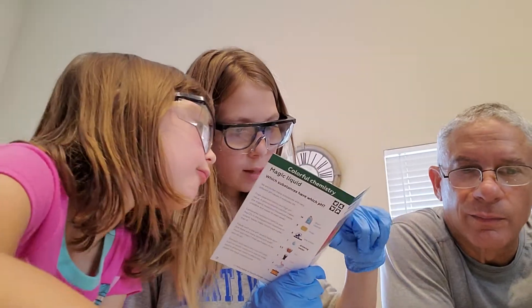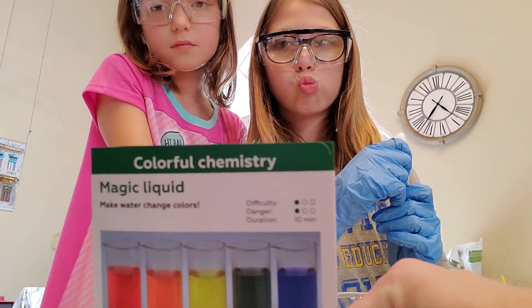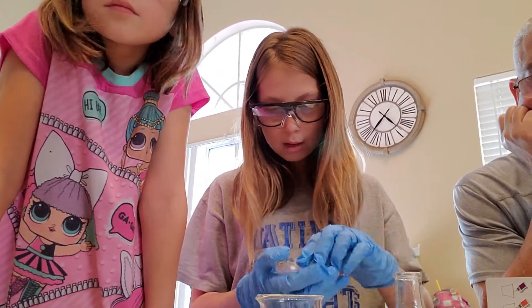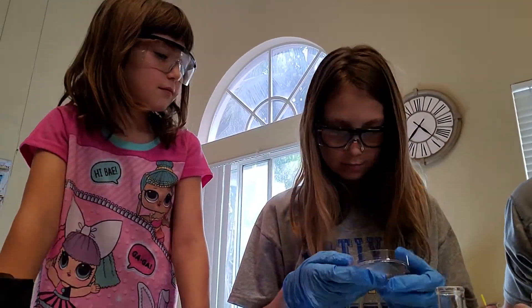We need timethyl blue. Timethyl blue. Can you look at my glove? Mom, what are you doing? Can you open this, please? I can't open anything in gloves.